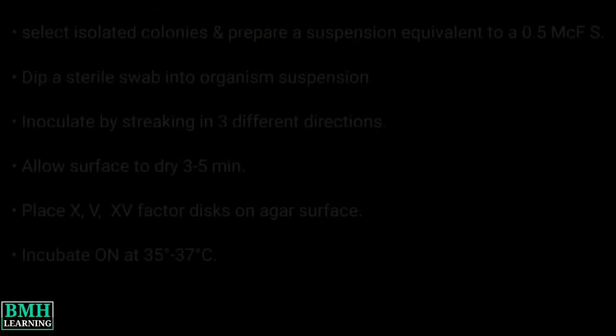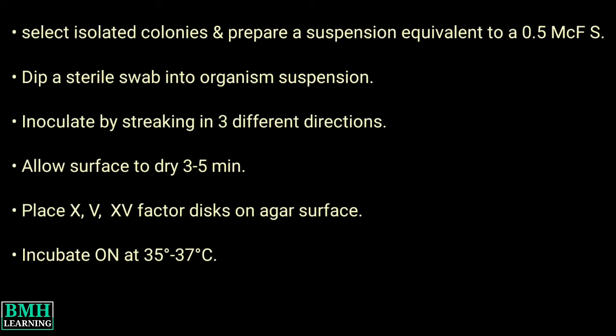Procedure: using aseptic technique, select isolated colonies and prepare a suspension equivalent to a 0.5 McFarland standard. Dip a sterile swab into the organism suspension. Inoculate by streaking in 3 different directions, rotating the plate at a 60-degree angle after each streaking. Streaking in this manner ensures confluent growth.